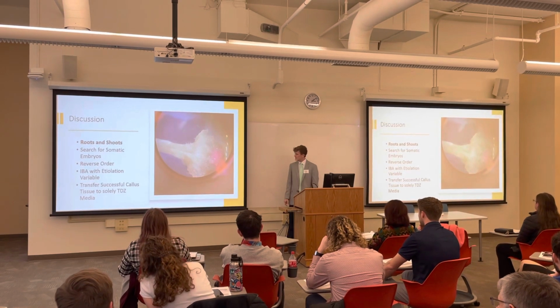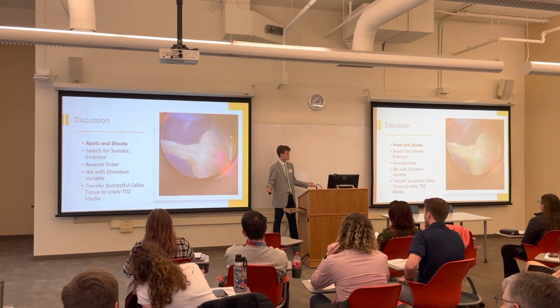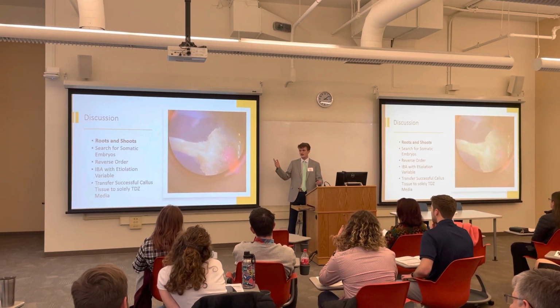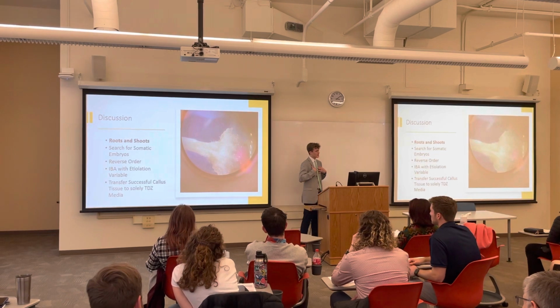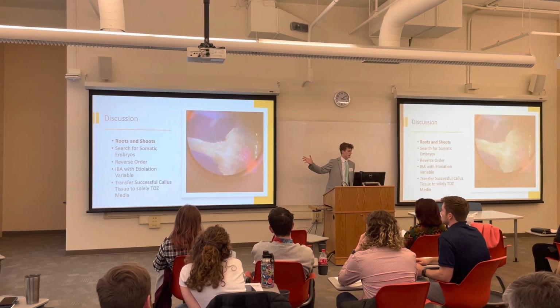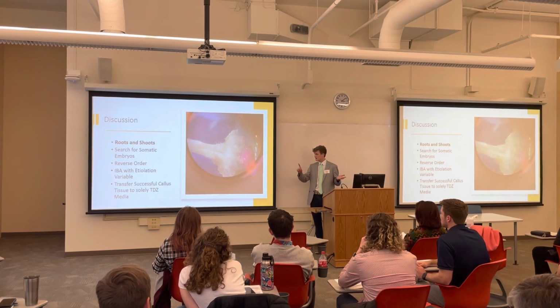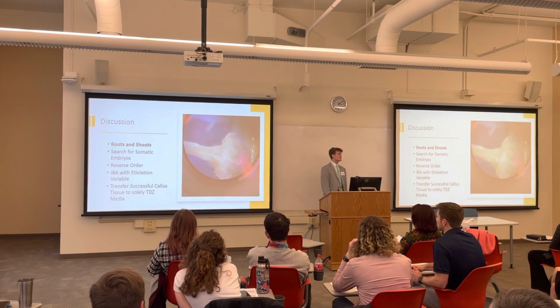In discussion here, what do we want? What's our success rate, right? It's roots and shoots. We want one plant to survive that has both roots and shoots from something that we have done in tissue culture. This is great. This is really great in theory. We've done it once. Again, out of thousands of trials, it's happened once, and we still haven't figured out this system.